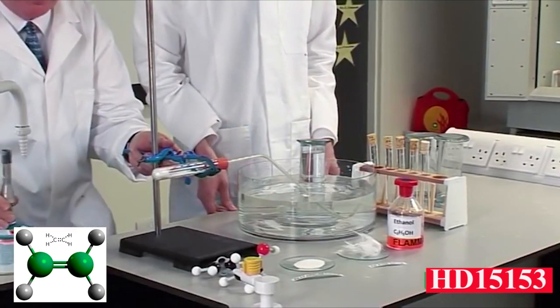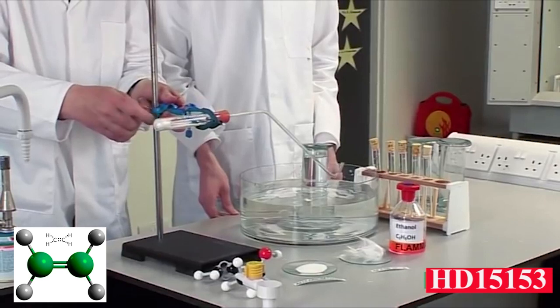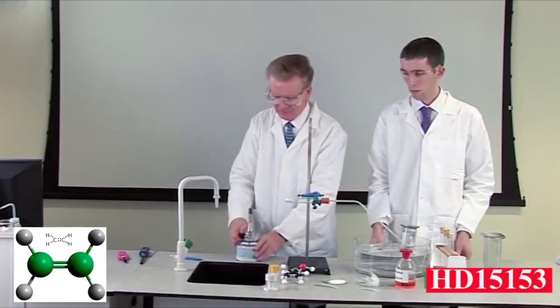When all the test tubes have been filled, loosen the boss head on the retort stand and raise the apparatus up so that the delivery tube is no longer dipping into the water. Then turn off the Bunsen burner.